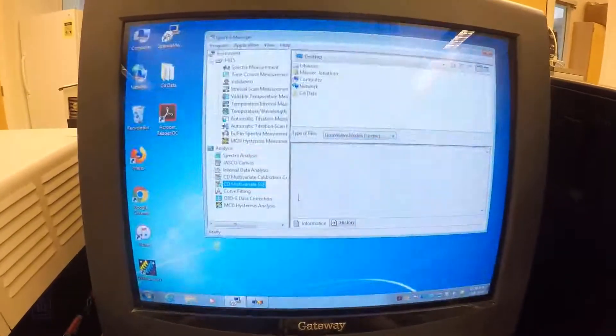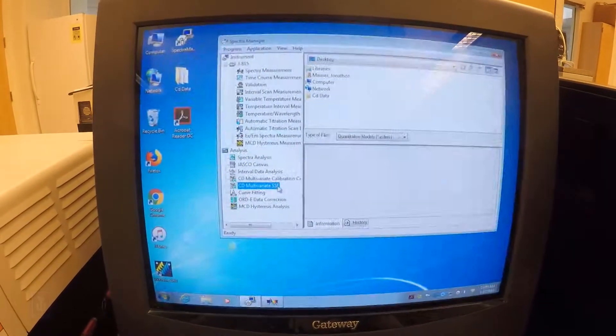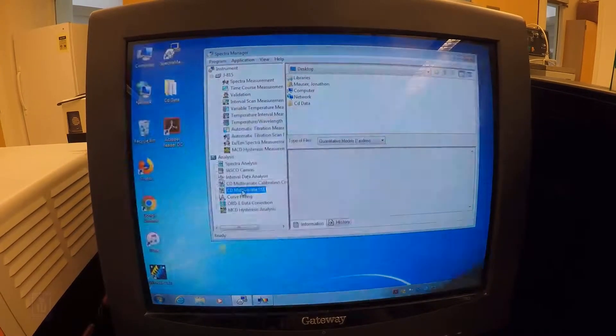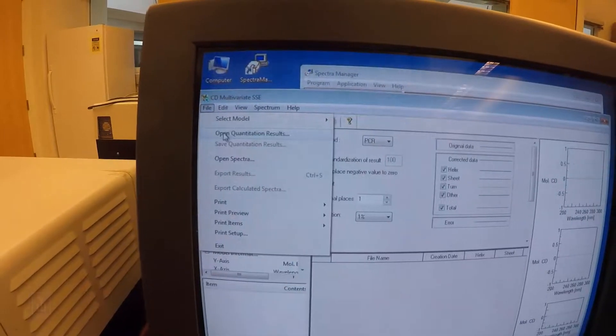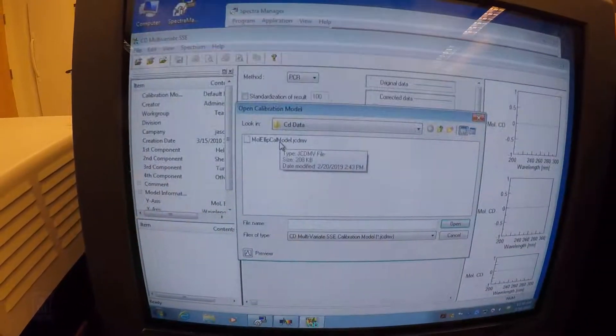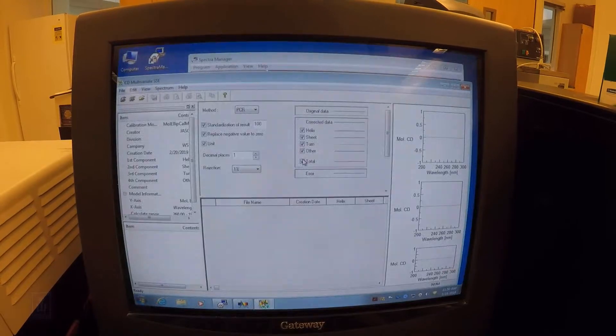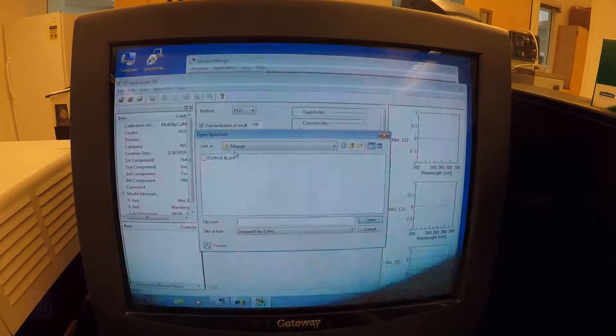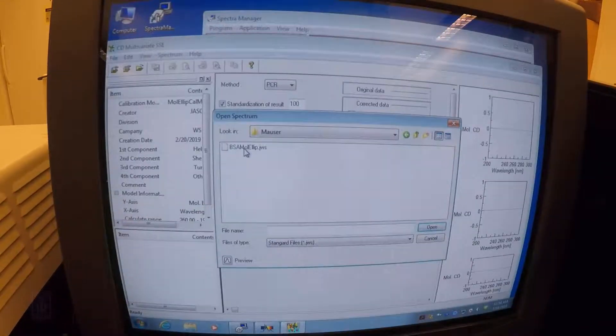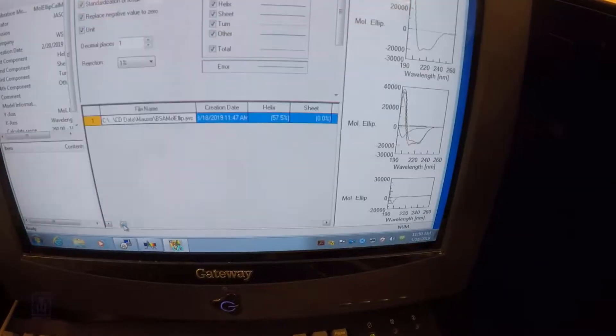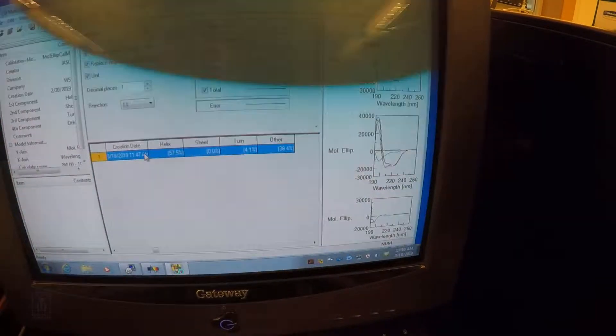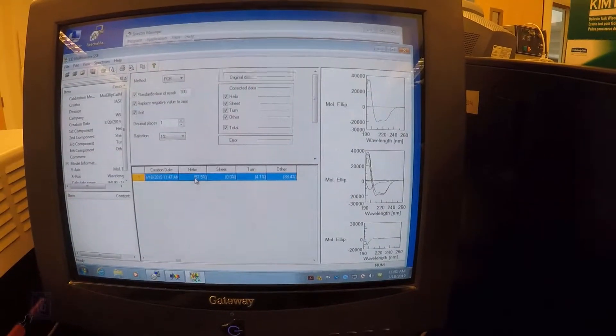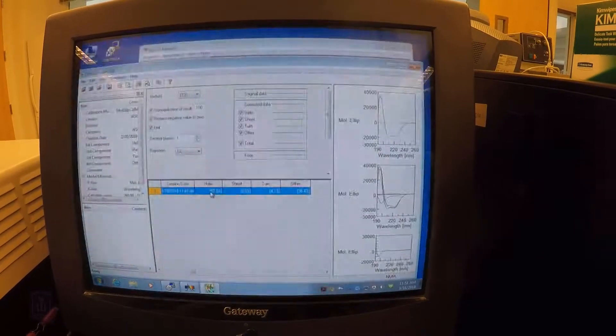If we want to actually look at our data and figure out how much percent helix it is, how much sheet it is, then what we're going to want to do is go to the multivariate SSE, here under Analysis and Spectra Manager, and then I'm going to want to open my data and my model. So first I'm going to go to File, Select Model, Open Model, and in my CD data I have a molar ellipticity calibration model, which is built out of about 90 to 100 different standards in terms of their helix content that's been solved experimentally. And then all we have to do is load our spectra back here in File, Open, and I'm going to go to my BSA molar ellipticity that I just saved, and it will spit out the helix content right there, which is 57.5% helix, which is right on board with what I expected. And then you can see it has some turns in it and then other content, which is probably unfolded or loops. So largely this is helix, and we expected that based on the appearance of its spectrum.